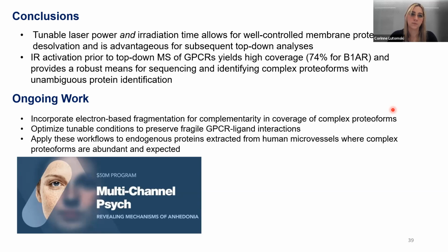Having the IR activation prior to top-down has given us 74% coverage of just a test system, which is B1AR, but it has proven itself to be a robust means for sequencing and identifying more complex proteoforms. And so this work is still ongoing.